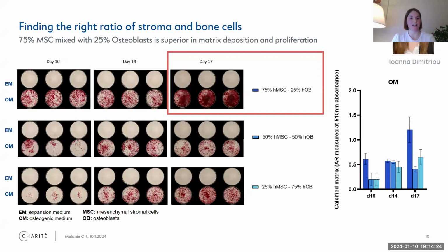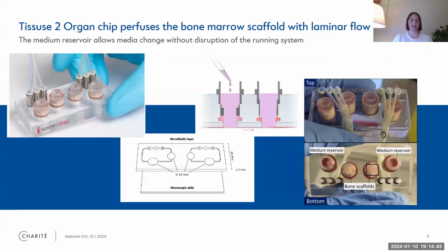So this was really nice, and it's just to illustrate that you always have to think in different layers. In this case, Annie showed that this was a nice mixture that you can then use in 3D, because it would be sad if you do all the work putting the stuff in 3D if it doesn't already work in 2D. So now, this is called on a chip. So I proudly present the chip.